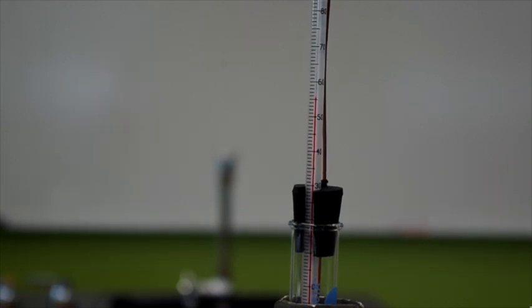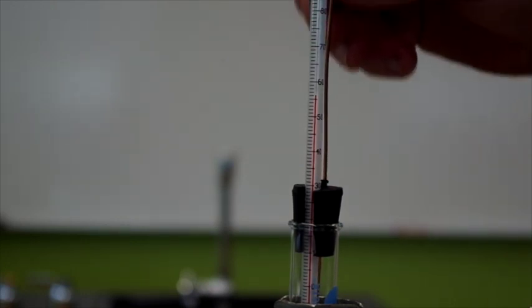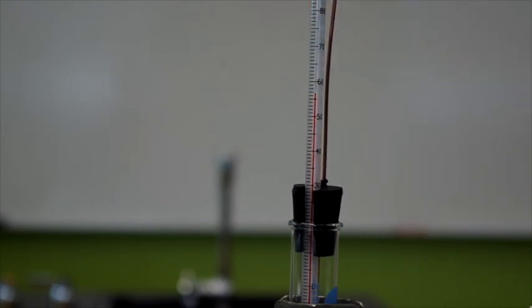We gotta get up to 70. So what I'm going to do when this hits 70 is I'm going to pull it up out of the water and swing it out and start the timer. Okay.